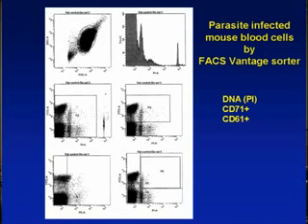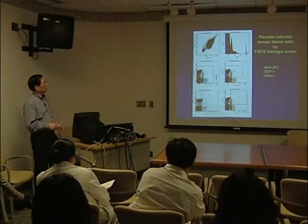But since we are doing this for a different purpose, we have to use a different instrument, because we also like to sort these micronuclei out, so that we're able to study exactly what the components of DNA or chromosome are in those micronucleated cells. Also you have to know that if you have different kinds of instrumentation, you should always run this kind of control.